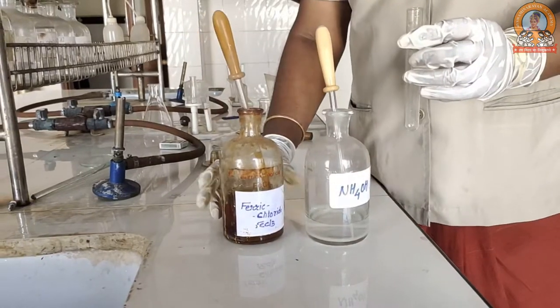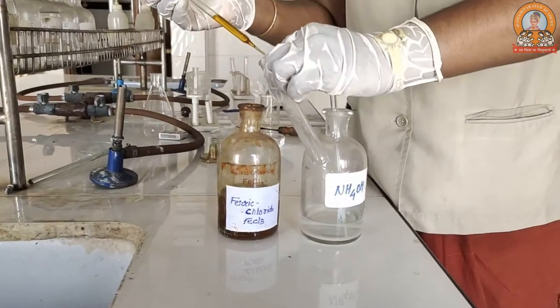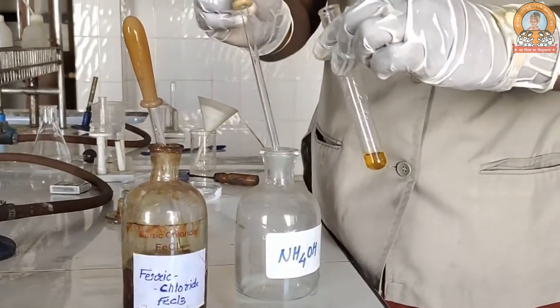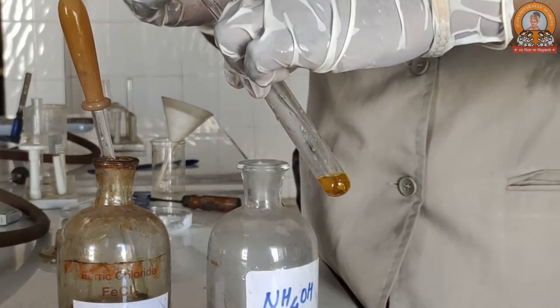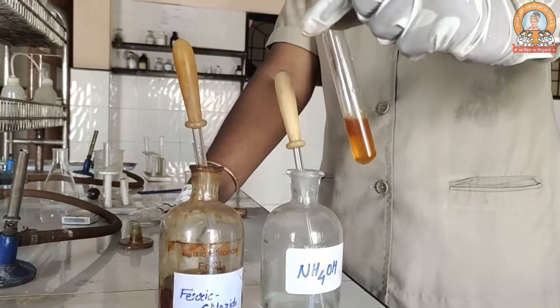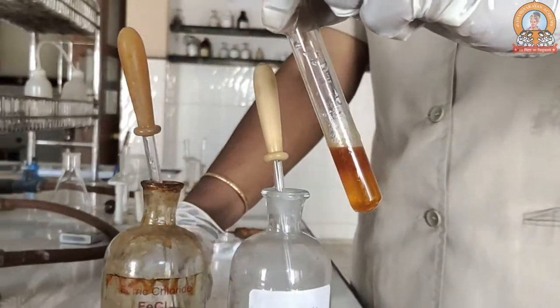The next test is the ferric chloride test. We have taken an aqueous ferric chloride solution. We will take a slight amount of this and then neutralize it with the help of ammonium hydroxide, the base. Ferric chloride is a Lewis acid, so it will be neutralized by ammonium hydroxide and it will create a brown precipitate, which shows it has been neutralized.